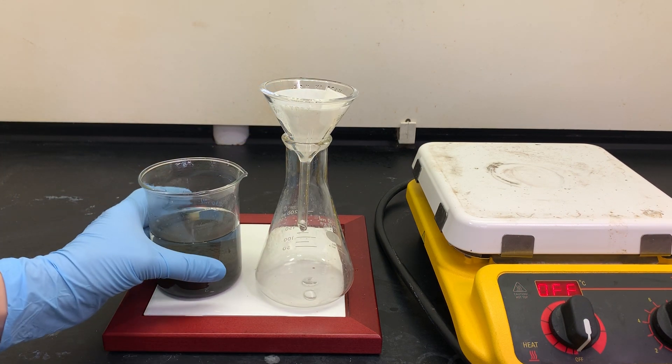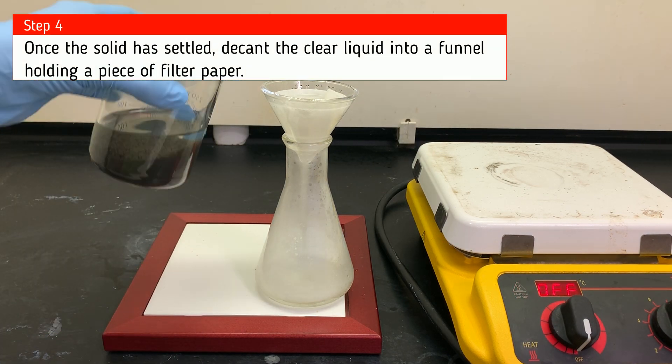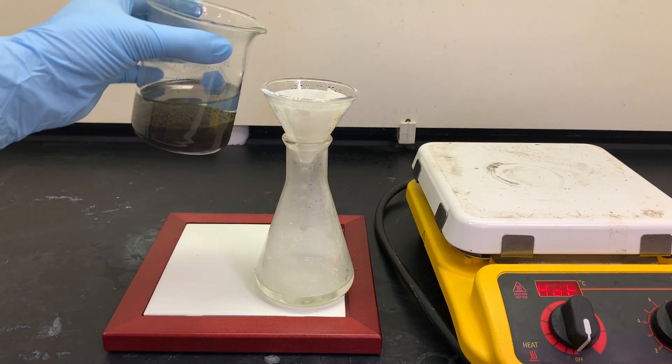Now we want to decant some of that liquid out, but we're going to pour it through filter paper just in case some of that solid residue gets poured off. Decant just means pour off the top layer.